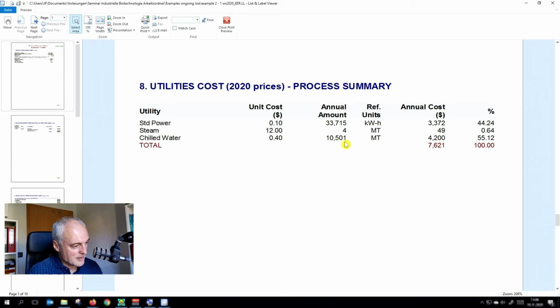The amounts are more or less the same as we have in our thing. Okay. We have now again set up a very, very simple process, which is kind of the same as before. We have a reactor. In this case, it was a bioreactor where I put everything in. The only change was that we had to classify distillers soluble from being similar to glucose, and we don't really know what is inside. And you see that the software is not doing a chemical stoichiometric balance internally, telling you where are my atoms. It doesn't care. You can write in everything you want, which makes, of course, the thing more flexible. However, this is then up to you to be sure that this is correct.